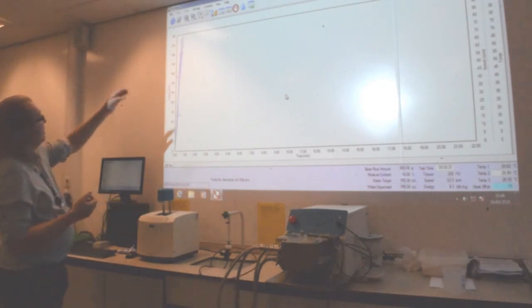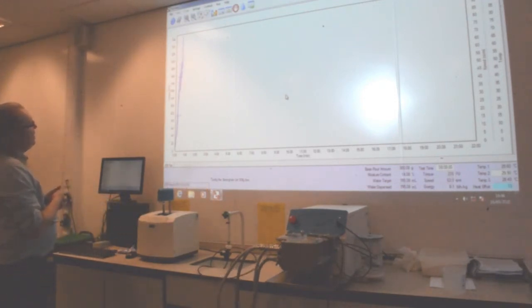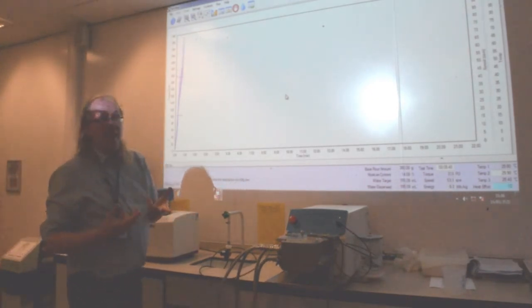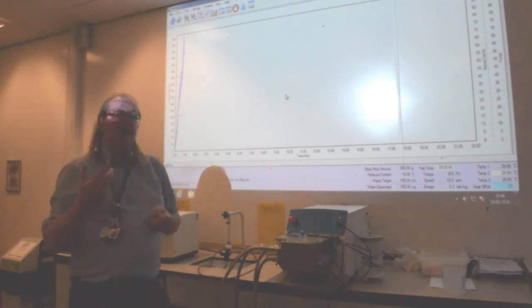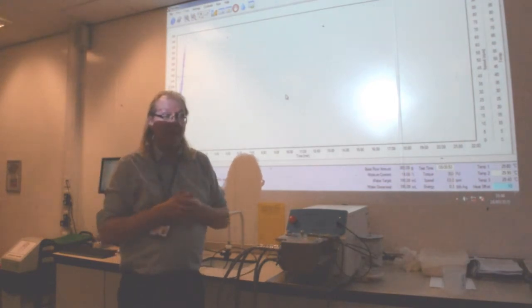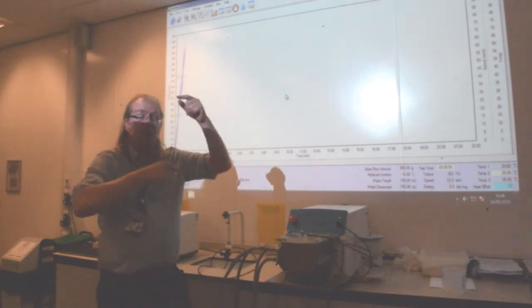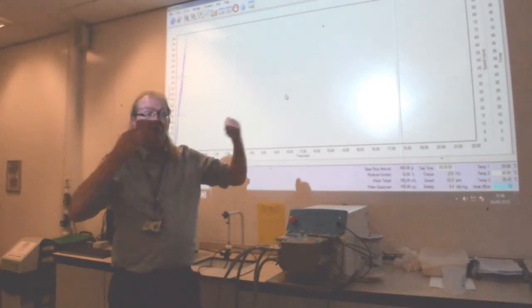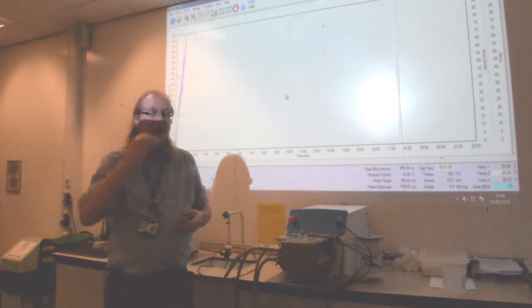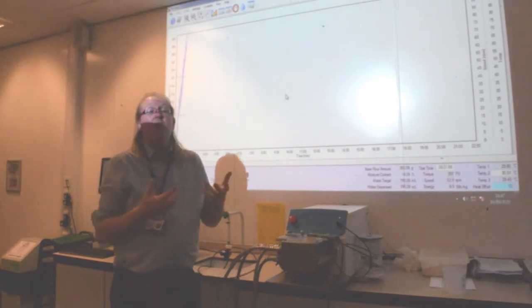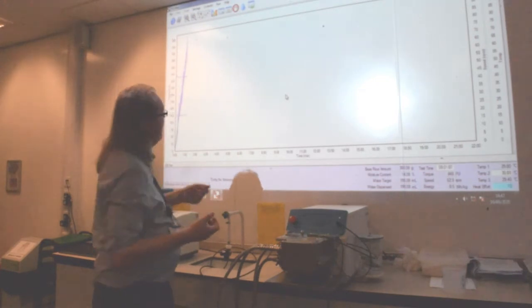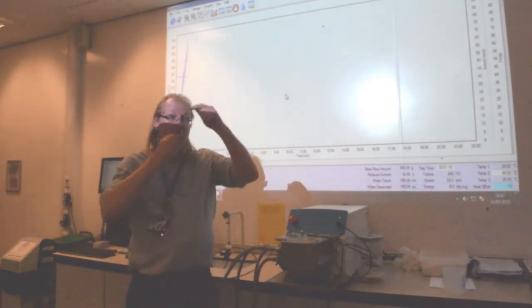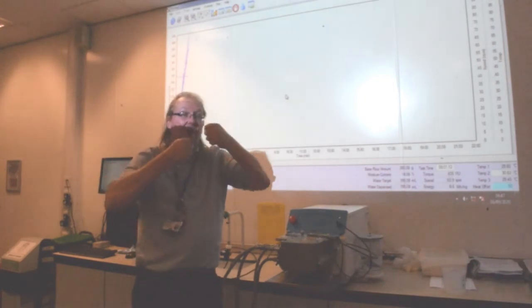It's starting to level off in places now. What we'll see in a few moments time is that on the graph there's actually three lines: a top line, a middle line, and a bottom line. The top and bottom lines are the elasticity, so how strong the gluten is. The middle line is an average of those two readings from it stretching and letting go.